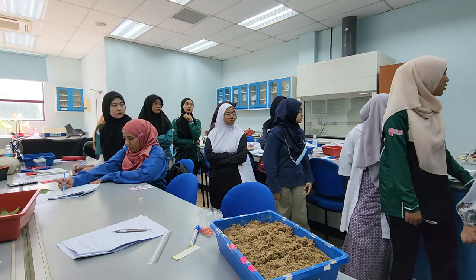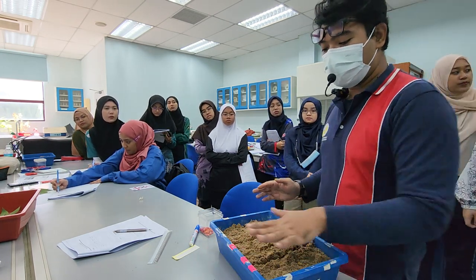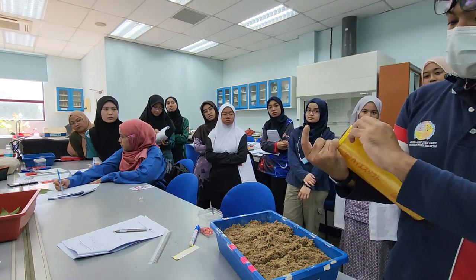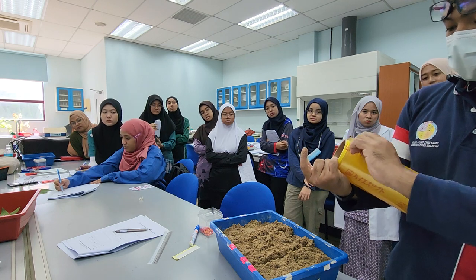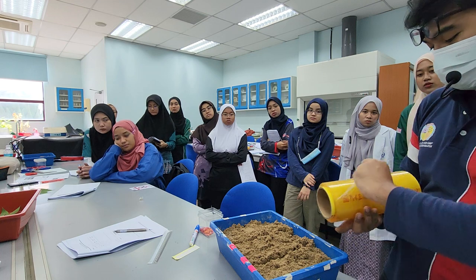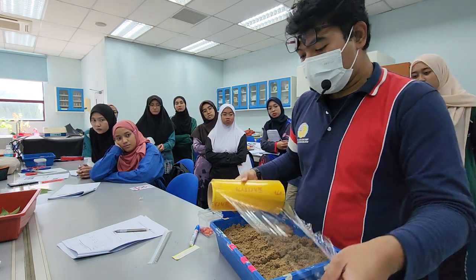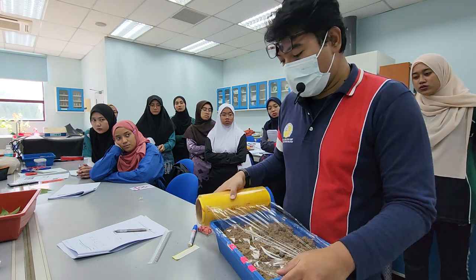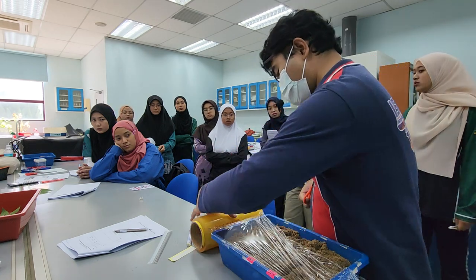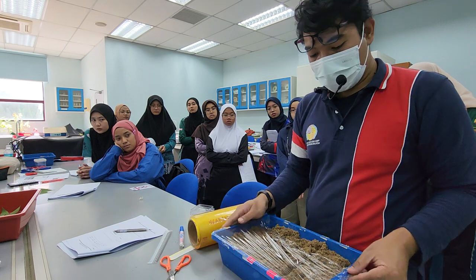Where is the plastic film? Please label, okay? This is 1, 2, 3. Use this plastic film and wrap it. Label it. Because this is corn, you might want to come and check this regularly. So, this is very stretchy, very easy.